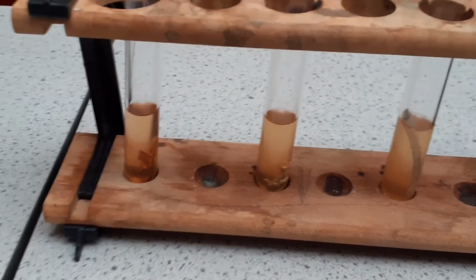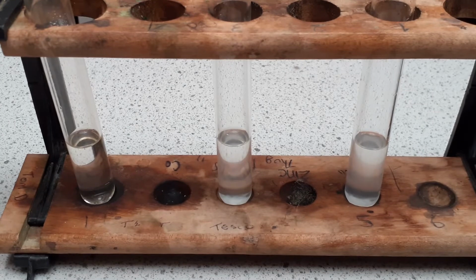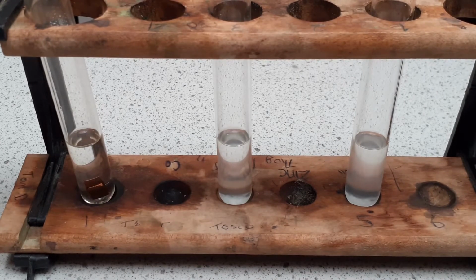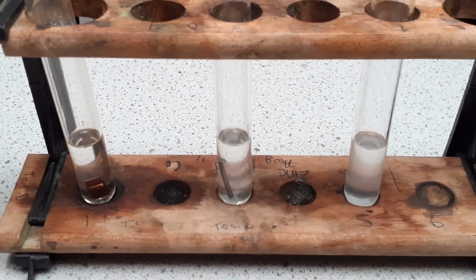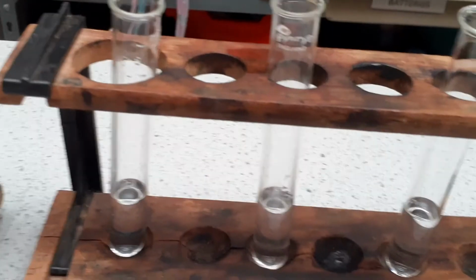Now, moving along further to our zinc sulfate. So the first one, piece of copper. Next one, piece of iron. And then to the last one, piece of magnesium. And finally, to the magnesium sulfate.